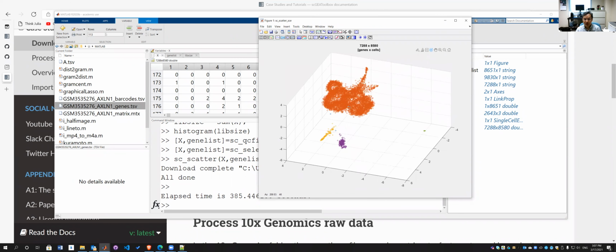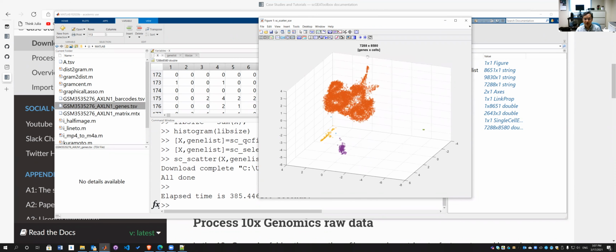So I'm going to give it a try, use the function inside the scatter plot. I will start from this purple group. I highlight this. And this small brush here tells me I'm going to search a database, the built-in database, a small scale database, and see what's the cell type of this group.